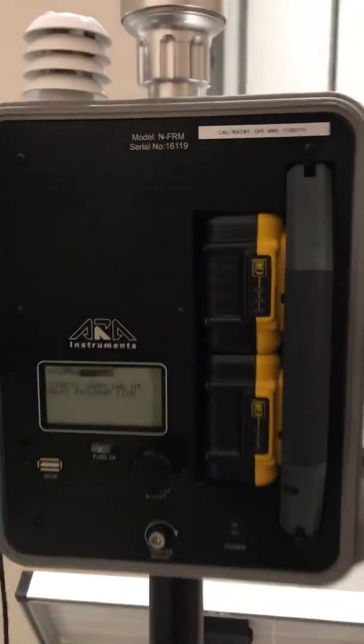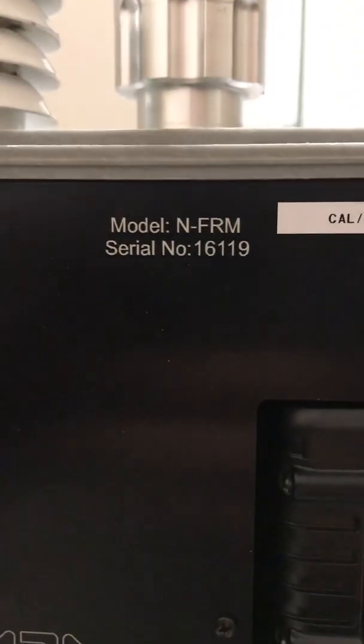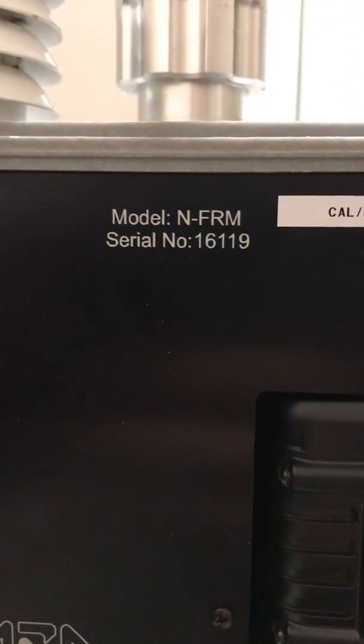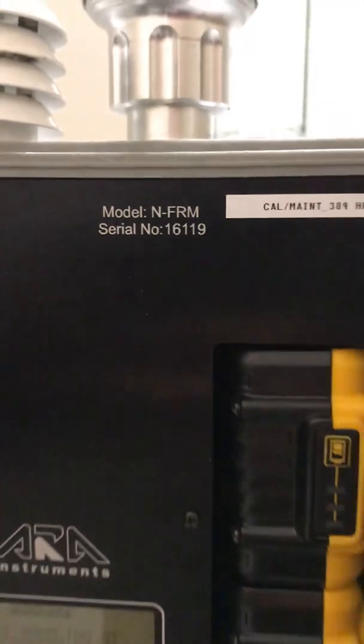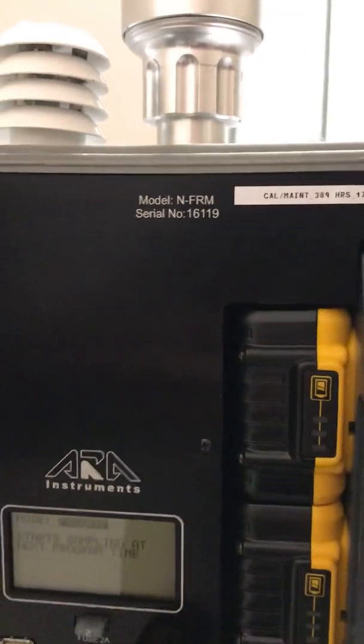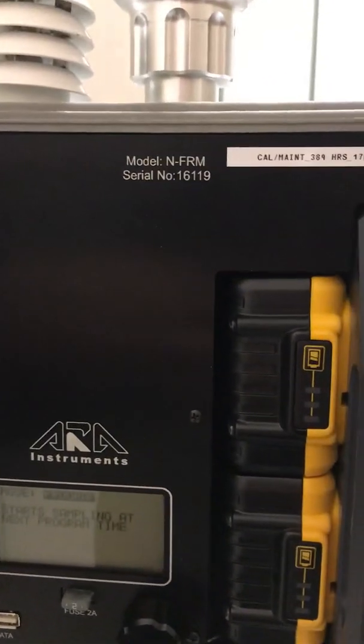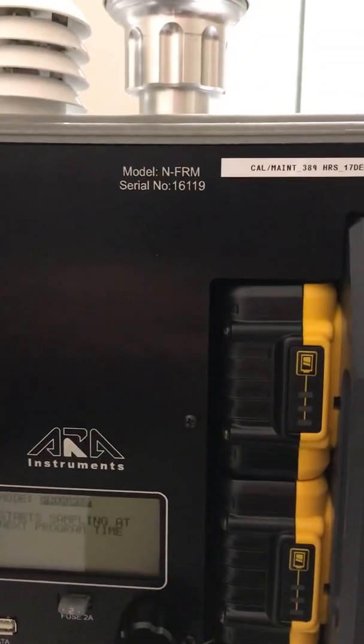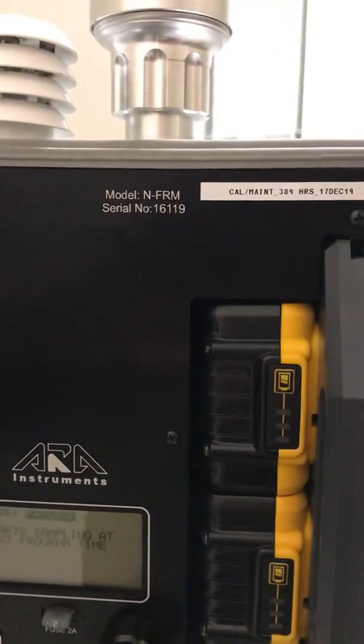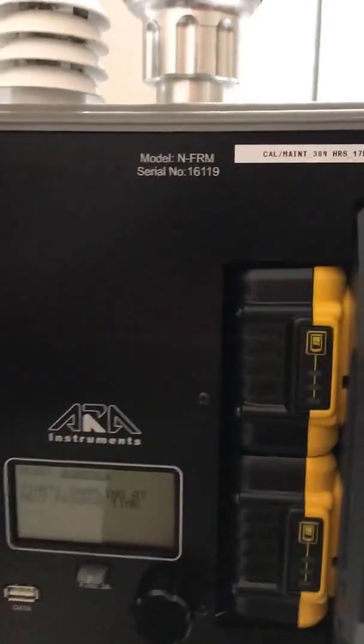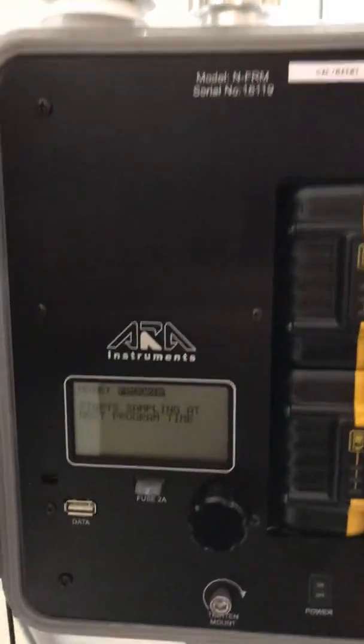This unit is called the model NFRM. The N stands for near, so it's a near federal reference method, and FRM is what they're calling this unit.